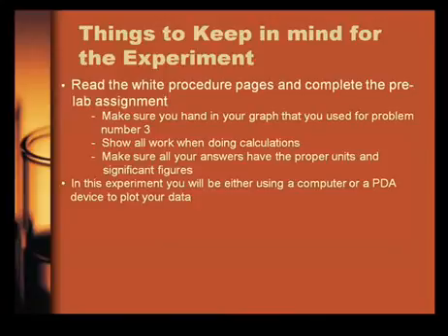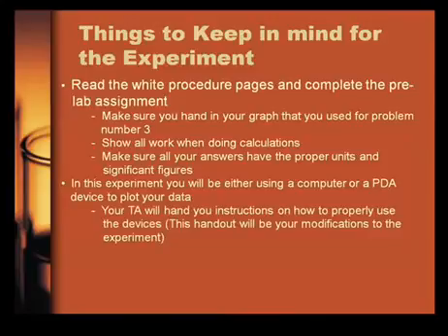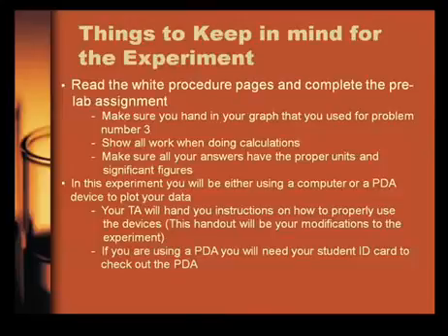In this experiment, you will be either using a computer or a PDA device to plot your data. Your TA will hand you the instructions on how to properly use the devices, and this handout will be your modifications to the experiment. So it will tell you how to do the experiment using the computer or the PDA. If you're using a PDA, you will need your student ID card to check out the PDA. So you will not know if you will be using a PDA, so please bring your student ID card with you to lab this week.